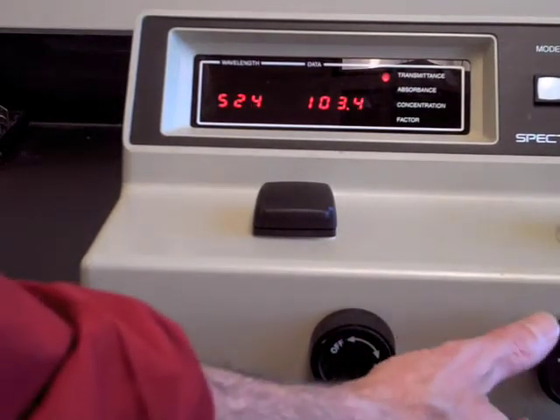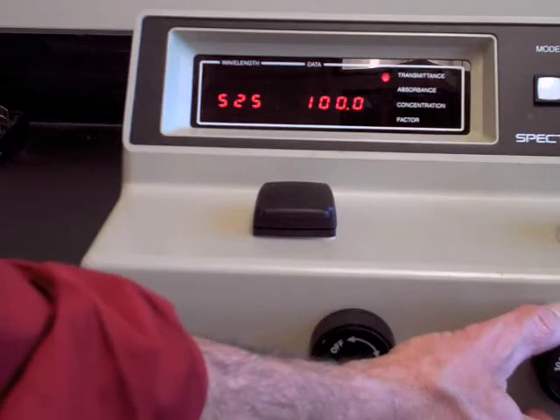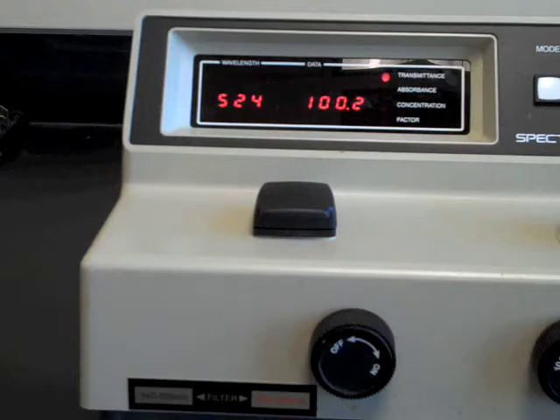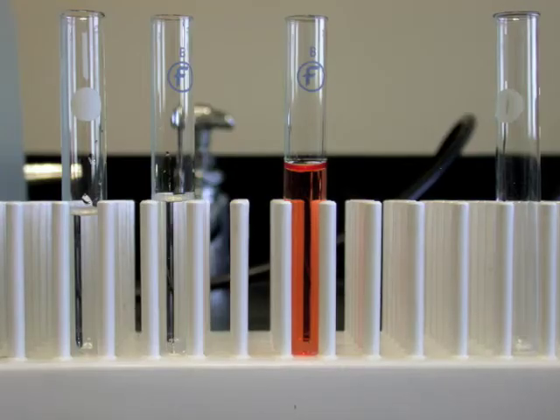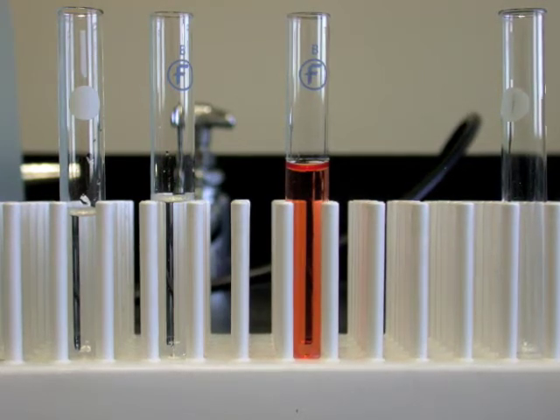There is usually a little bit of noise — the number may jump around about plus or minus two in the last digit on the far right. Don't worry about that. The light beam passes through the bottom third of the cuvette, so filling it a little over halfway is plenty.